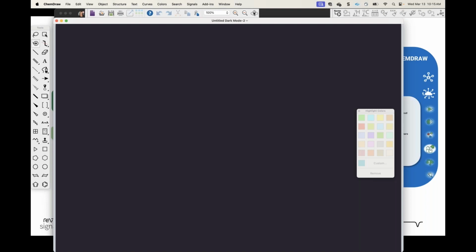You can actually even use ChemDraw Desktop offline. You don't have to be connected to a Wi-Fi connection after you have licensed and authenticated to be able to use ChemDraw on a daily basis. You will have to periodically log in again and authenticate against your license. This is just a standard part of the process.